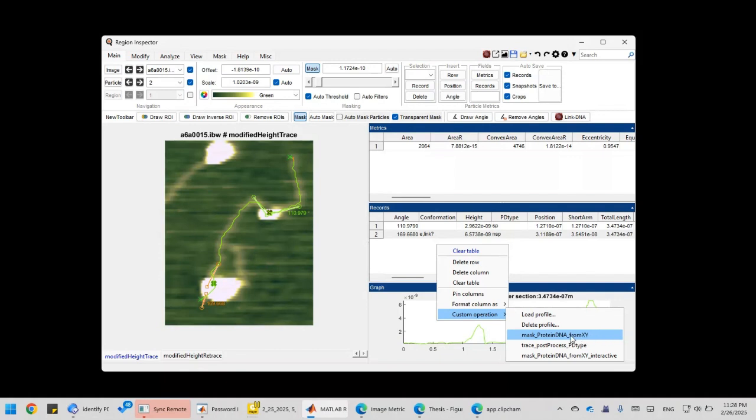You can also edit the parameters in the script file, and I'm going to show you later what's inside the script file. Now if you want to change the parameters on the fly, you can just use the interactive version. It will open up a dialog box where you can change the parameters. If you cannot find these two profiles, you can click Load Profile. You can find them under the Scripts folder inside the Image Matrix Programs folder.